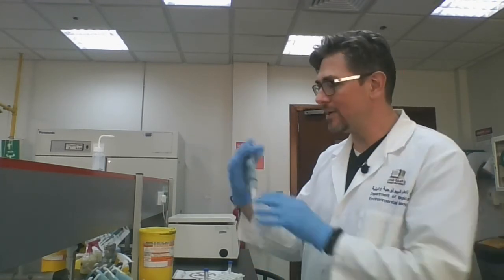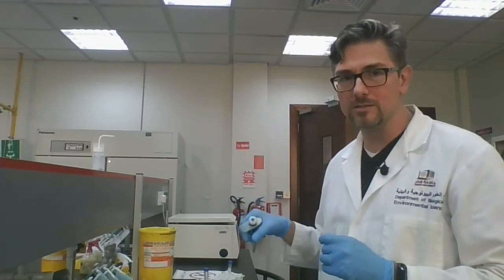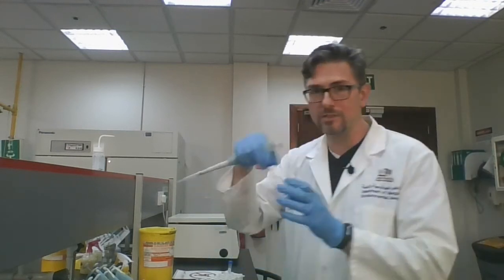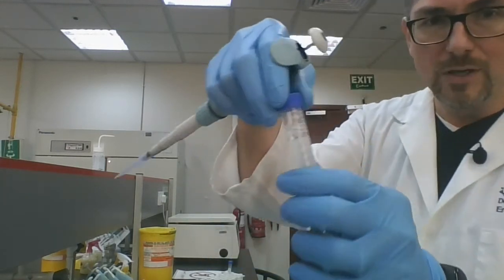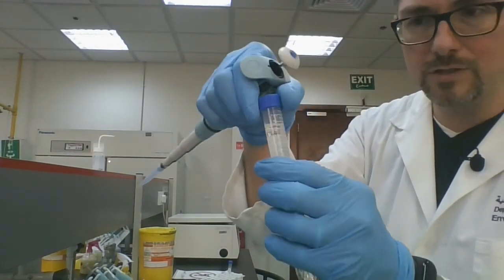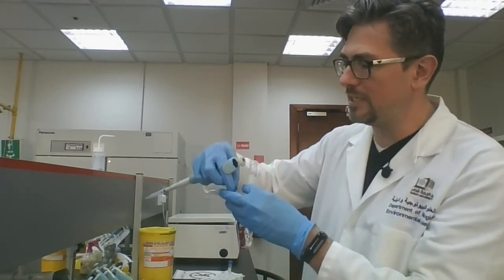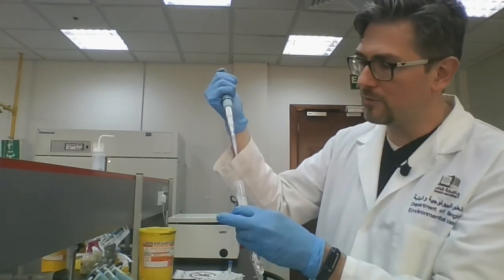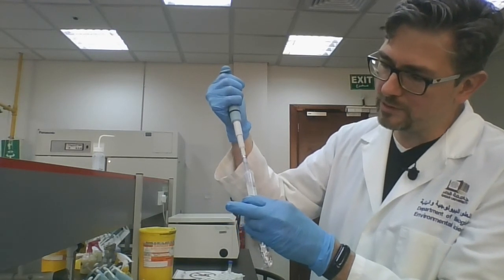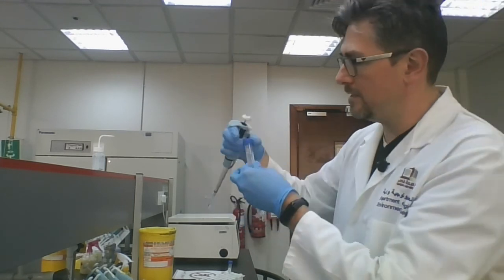Okay, so now what I need to do is I need to take my aqueous phase, and I'm going to add some organic solvent to this. So the phenol chloroform solution, that's in solution D that I pointed out earlier. So that's this stuff in here. Again, remember, we have two layers in here, so I'm going to have to get the tip below that upper layer of aqueous solution. I'm going to take the organic layer, okay? So I'm going to take 400 of that, so we're going to put an equal volume. So one of the reasons I set out a volume of 400 is so that I could just say, okay, take up 400 microliters of the organic phase, or the organic solution, and add that to your solution.